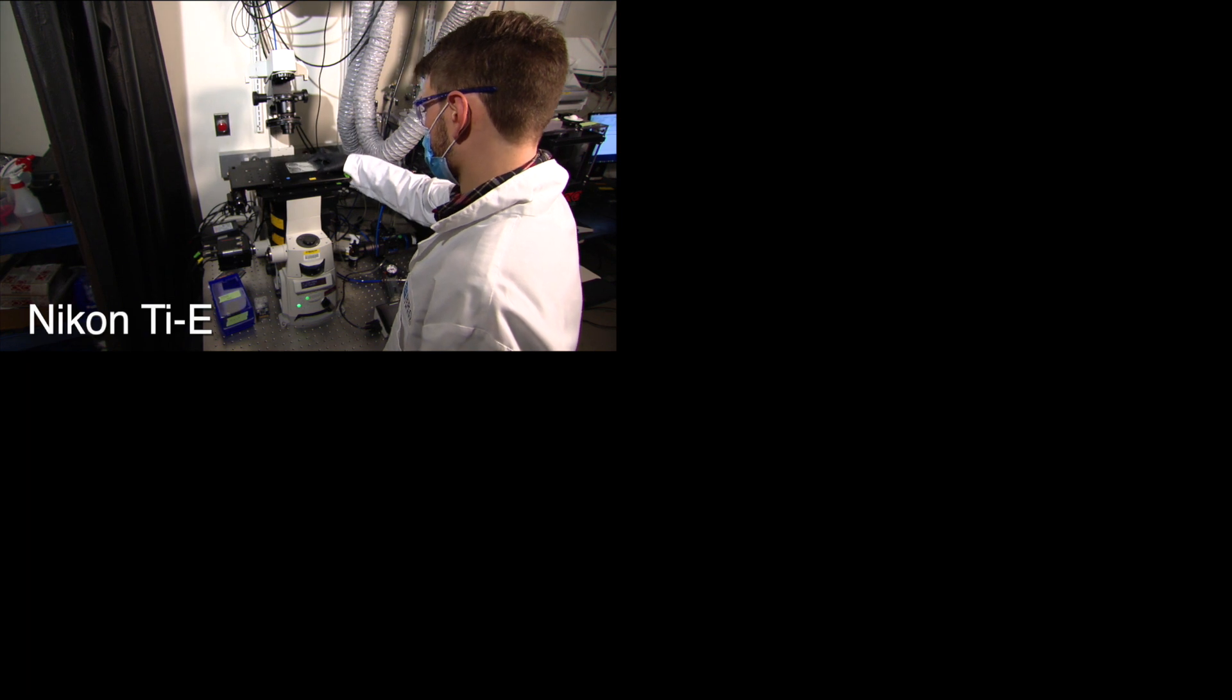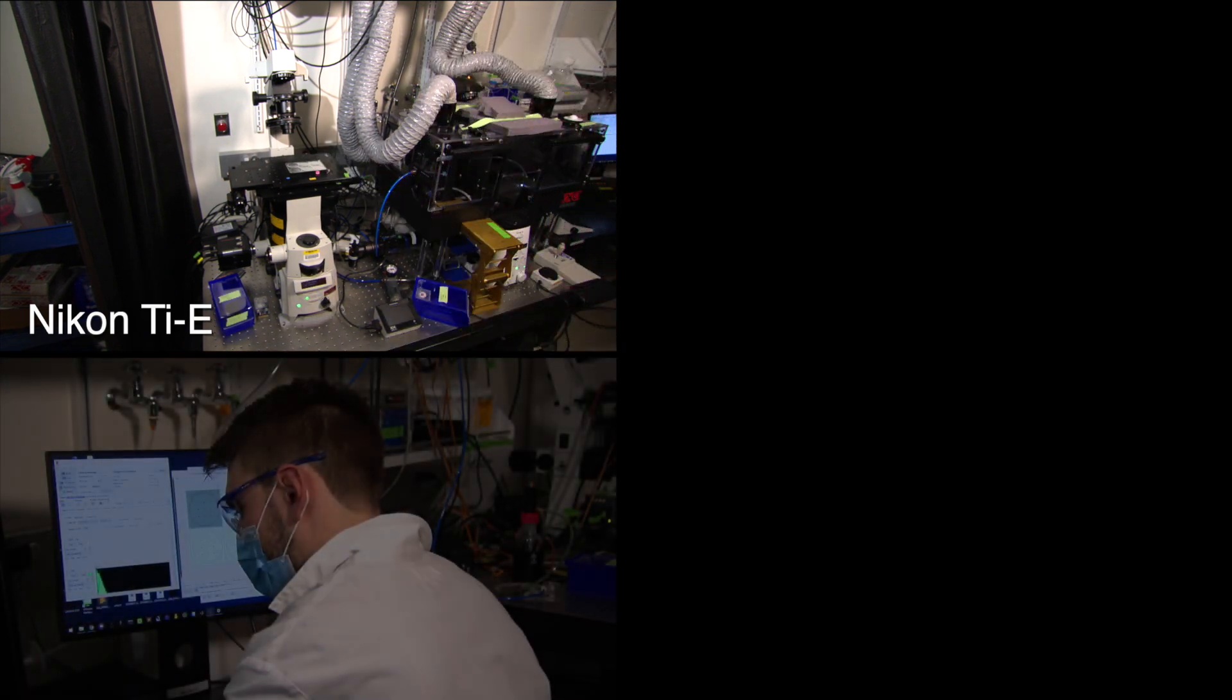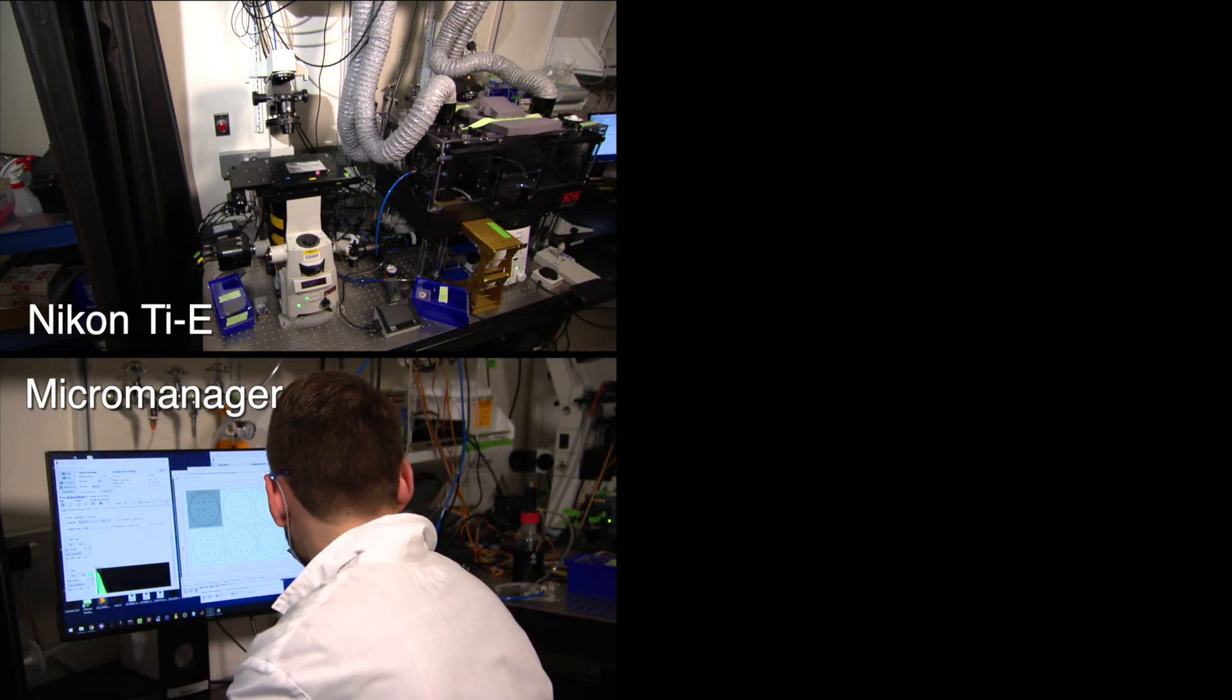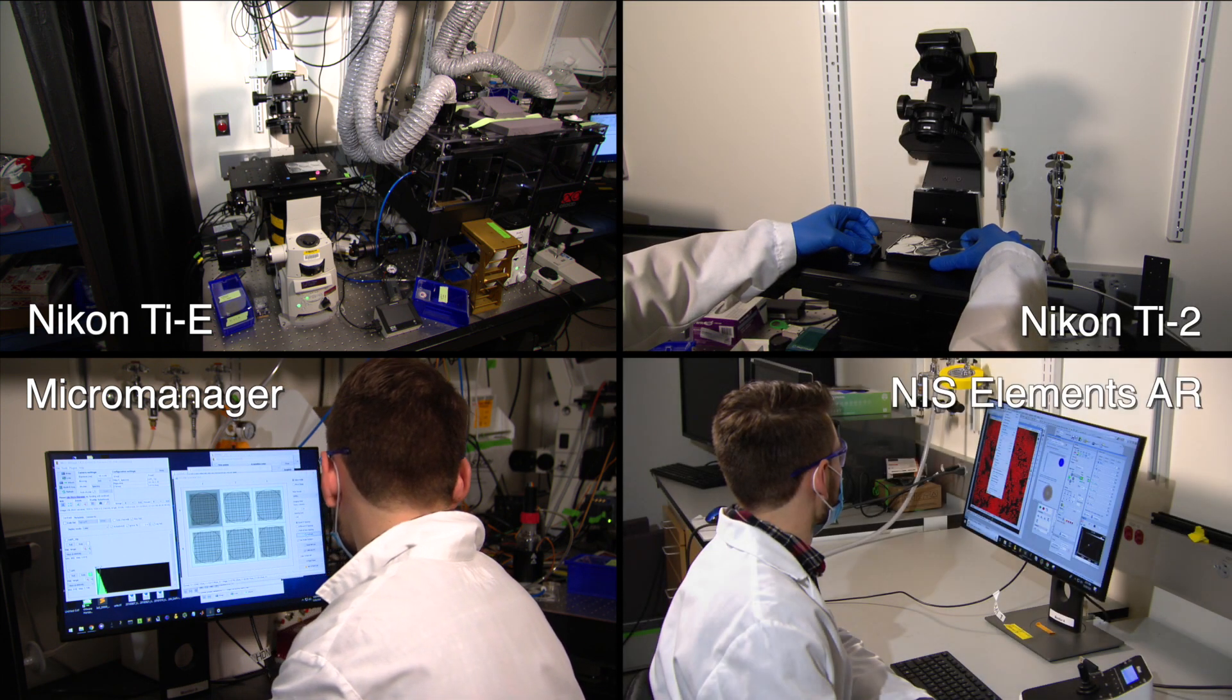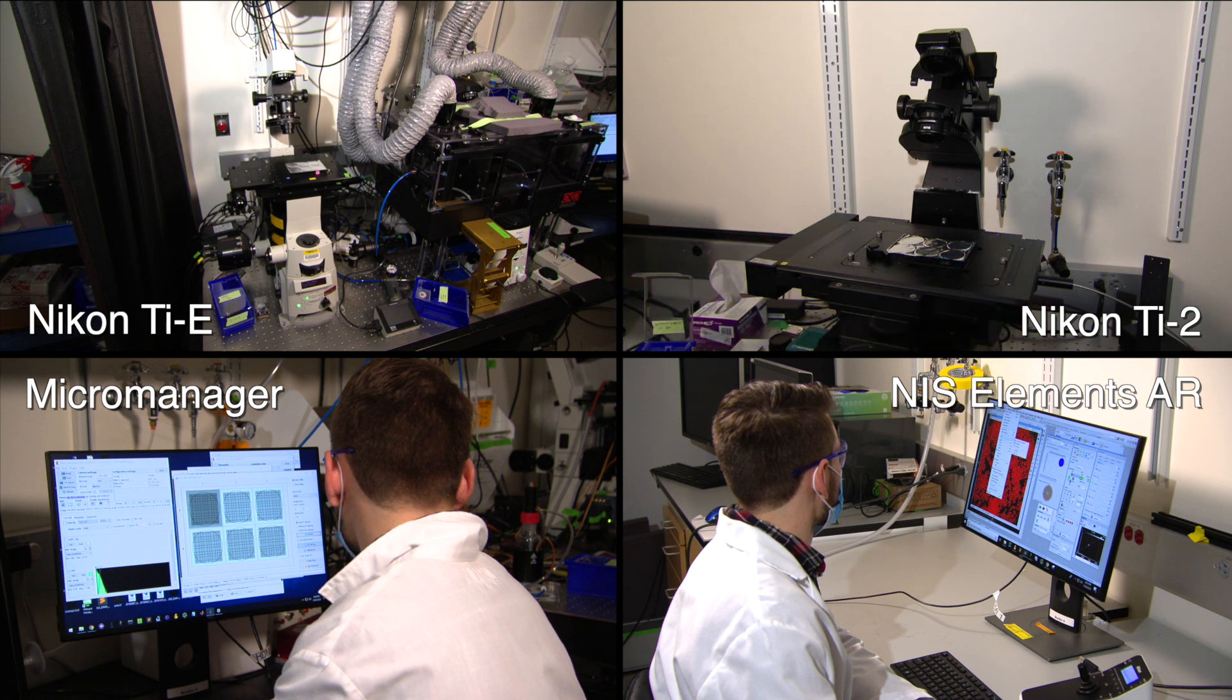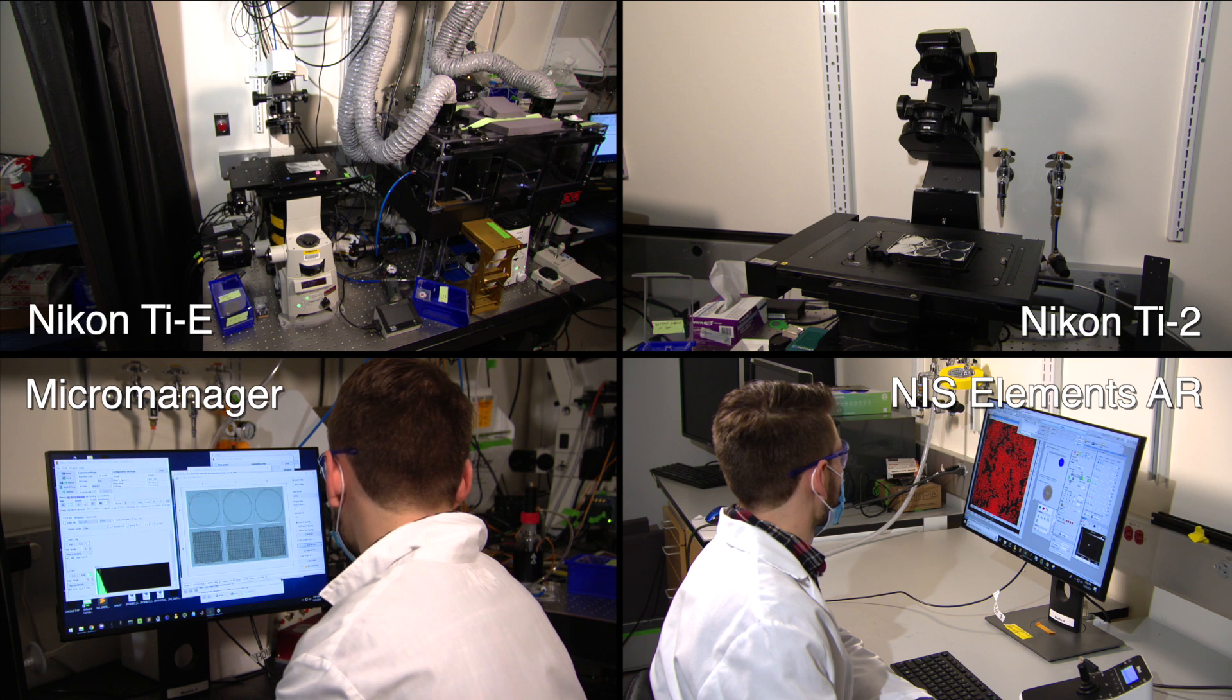Here, we showcase two different workflows. One on a Nikon TiE microscope using Micromanager for data acquisition and a second on a Nikon Ti2 microscope using NIS elements to control the imaging hardware. The first reflects the system we used in the original optical pooled screening manuscript, while the second is an updated system with improved imaging throughput.